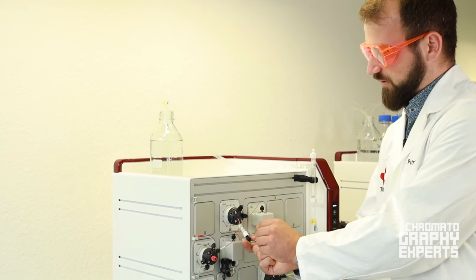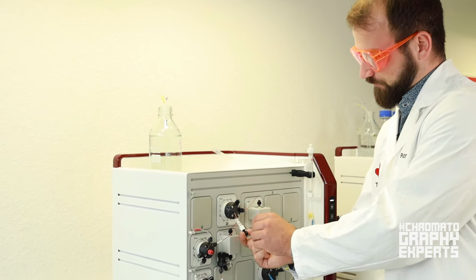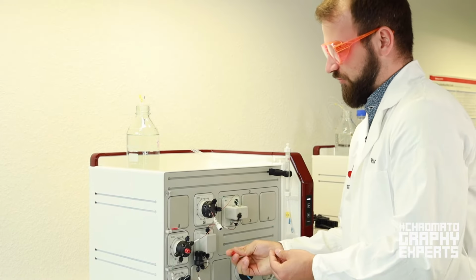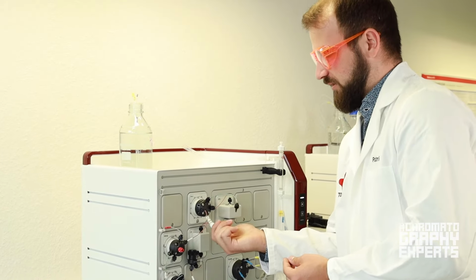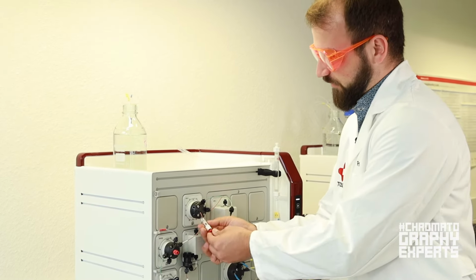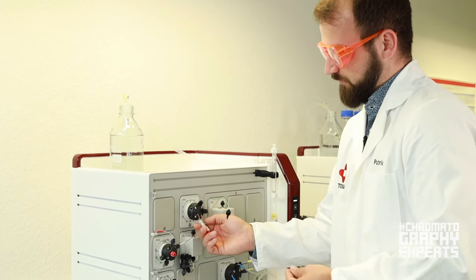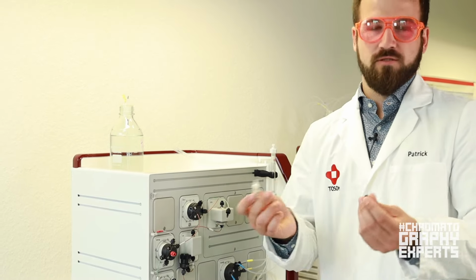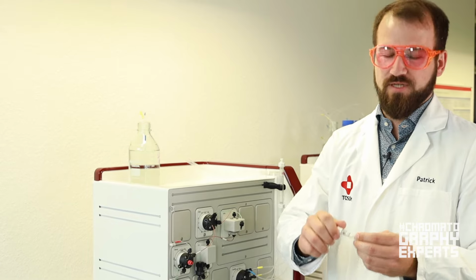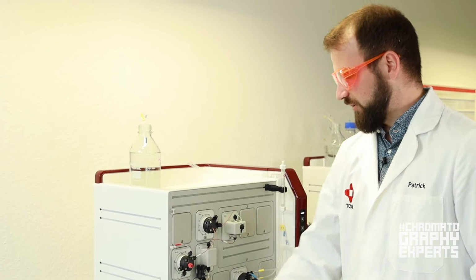So remove the top tubing. Then immediately seal the column so we don't get any air trapped in the column. Screw it out of the valve block. And just close the bottom end of the column. That's how easy it is to attach the 1 milliliter column.